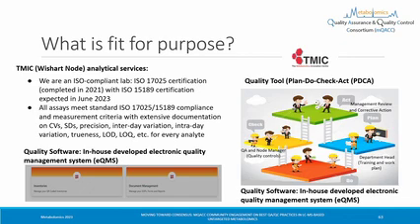Anything that's found wrong is acted upon. The systems are planned out and they're enacted so that data can be checked, and it's this nice kind of QA cycle, right? So you can see this is a little more formal. There's overhead in doing this, right? I discussed with a colleague last night who's starting to work towards ISO certification, and it's a pain, right?